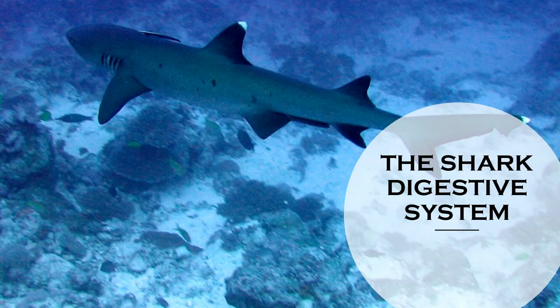Hello everyone, my name is Sarah and I teach a comparative anatomy lab. Today's video is the shark digestive system. I'm going to show you a series of photos from a shark dissection. All of the parts of the digestive system are labeled, laid out very well, and we'll also go over the function of each organ. Let's get started.